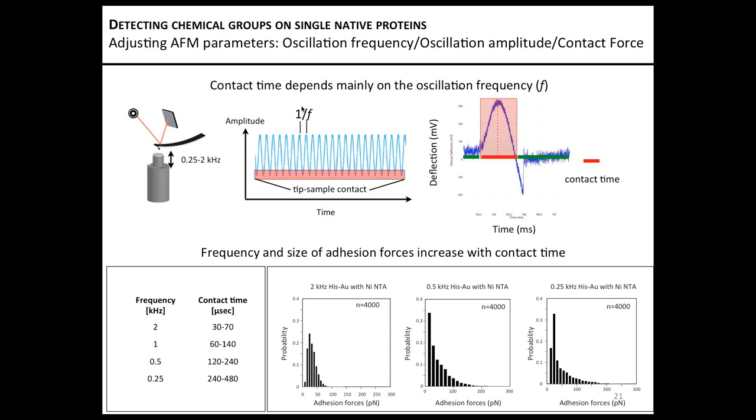Another question: in your opinion, what would be the optimal chain length for the PEG spacer to be used for functionalization of the tips in combination with QNM? In reference to high resolution imaging or to cellular imaging? Well, you can mention both of them. I think it could be interesting to our audience.